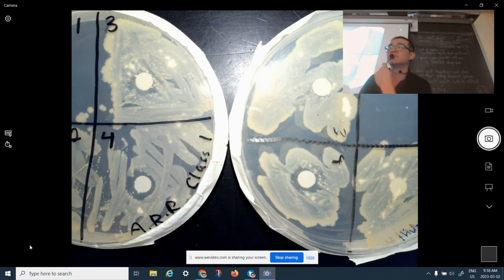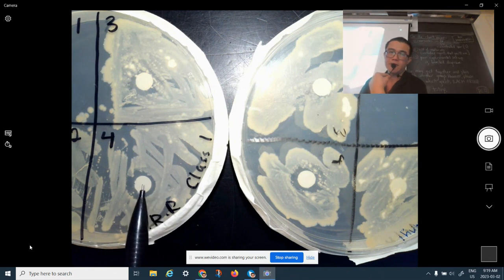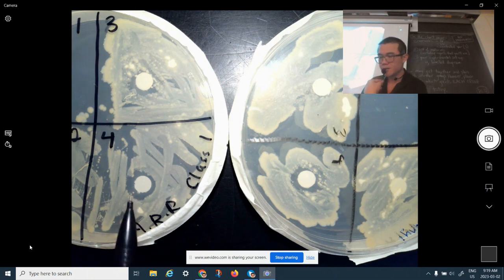Yes? Maybe try measuring the radius from the middle of the zone. Because some people might try and measure from the white part in the middle, but maybe you can try just the middle of the circle in general. Okay, so if you try from the middle of the zone, and then you measure, let's just say from here, the distance will be slightly different from here. So you can try the smallest radius and use that as your answer. Use the smallest radius, okay?